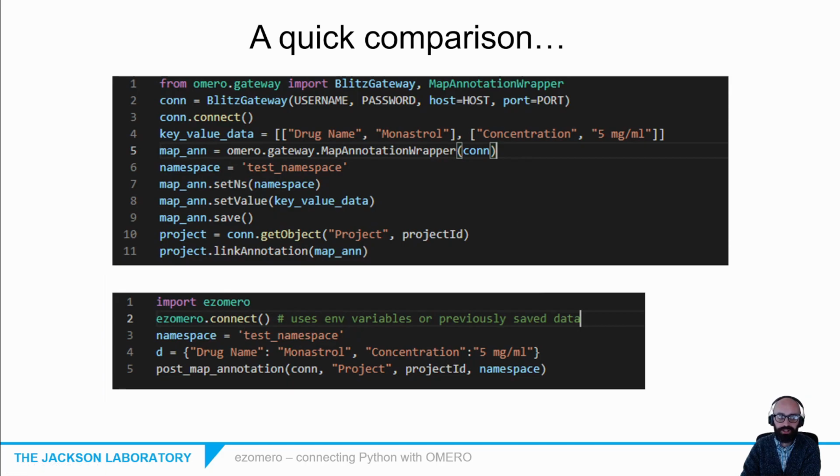Sometimes the out-of-the-box functionality of OMERO is not quite everything that you need. If you want to do some advanced viewing, advanced management, or analysis of your data, that's when Python comes to the rescue. The OME team provides a robust Python API to interact with an OMERO server.